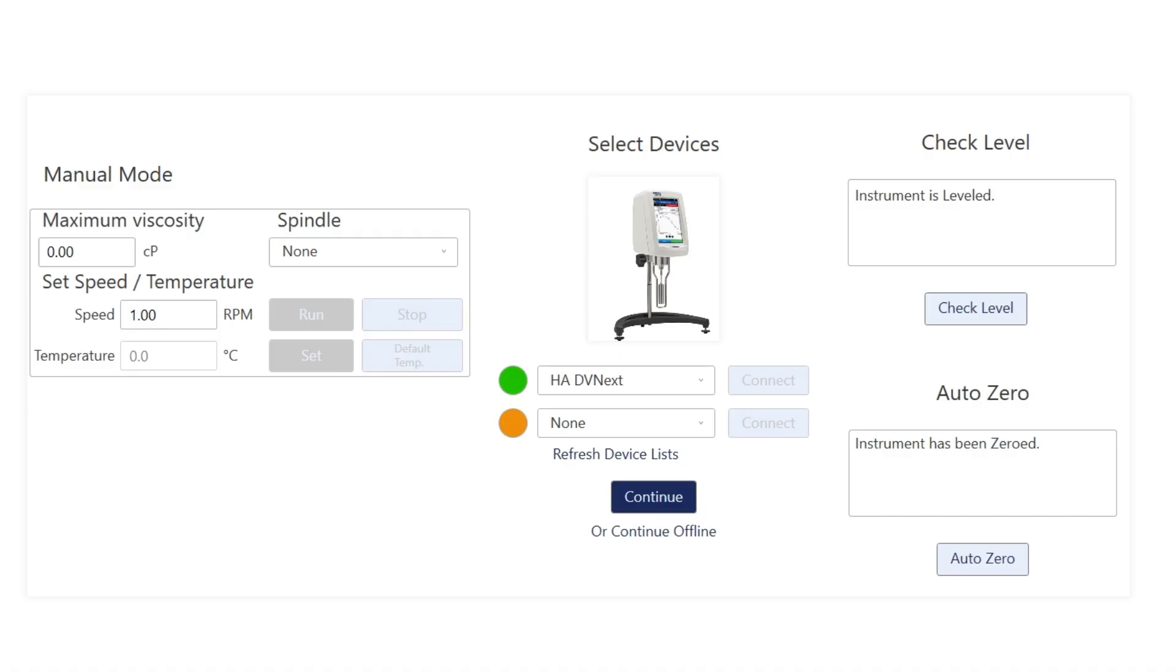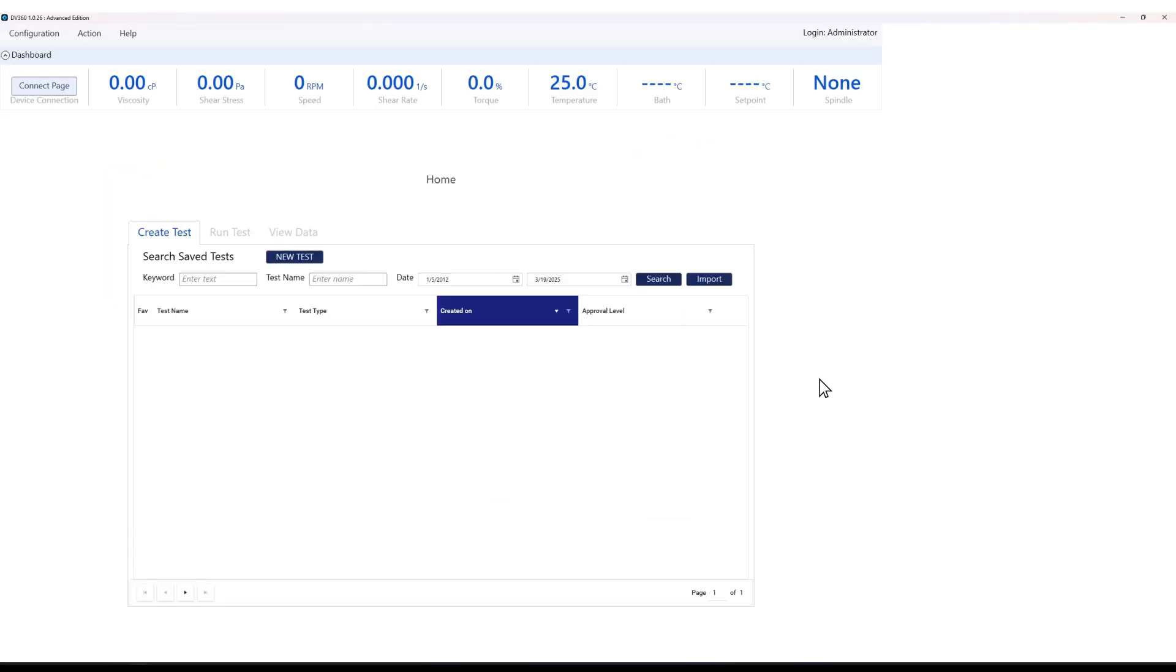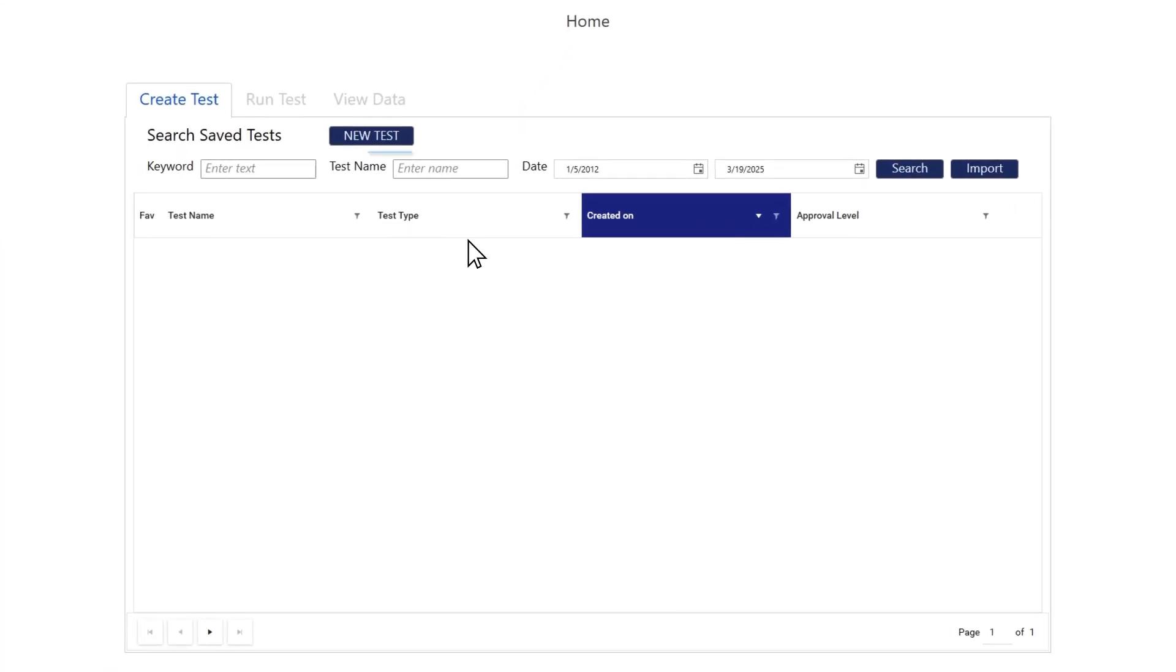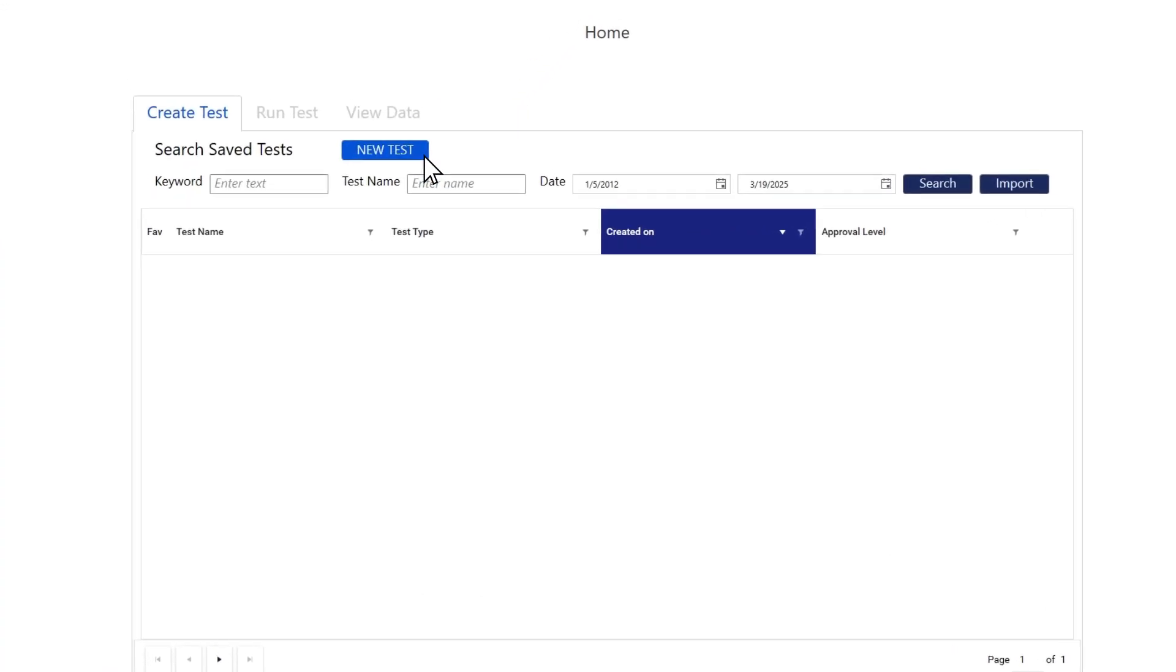Now we can press Continue and start setting up our test. You need to connect to at least one instrument before you can create any tests. At the moment, we don't have any saved tests, so let's create a new one.